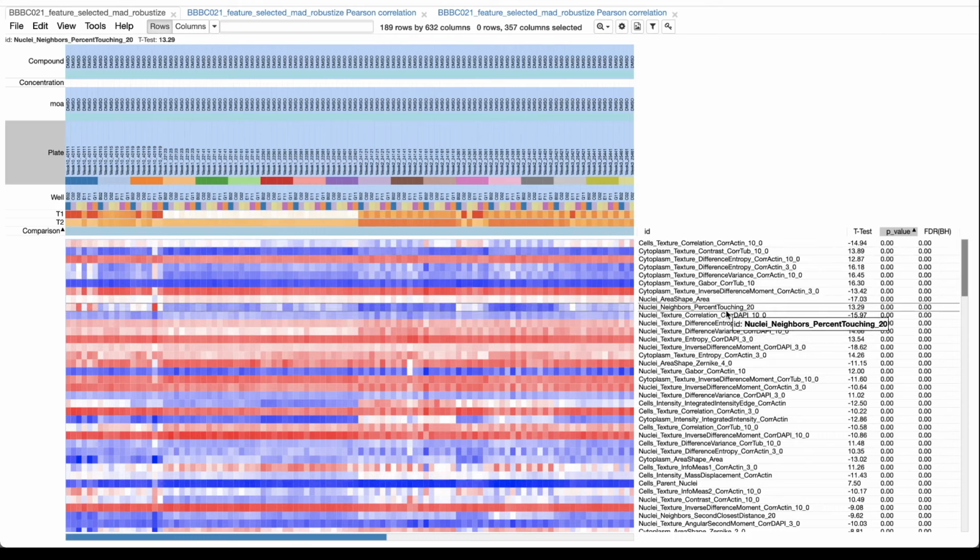And so you need to be a little bit careful with doing these, but sometimes you get an obvious answer such that the top 20 things are all nuclear features or are all features that are related to a particular channel. And in that case, you have a really strong place to start from in terms of guessing what actually is happening in your biology and therefore what your next experiment might be or what are good things to do to validate it.